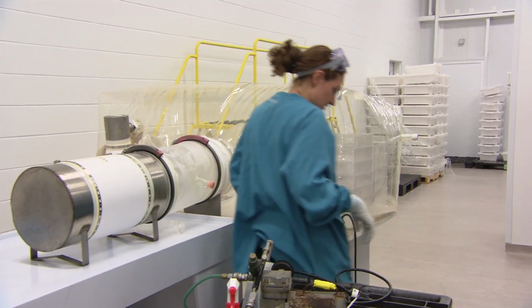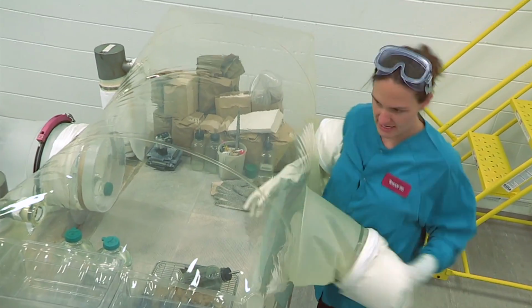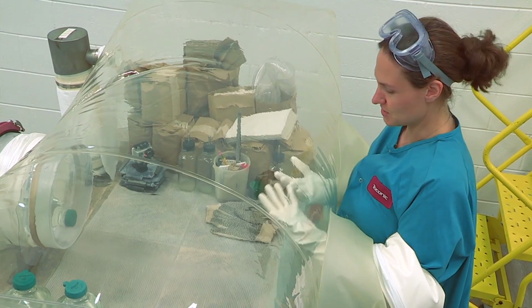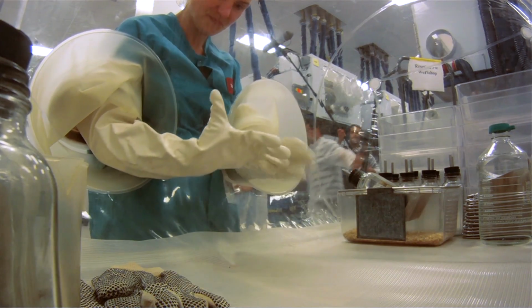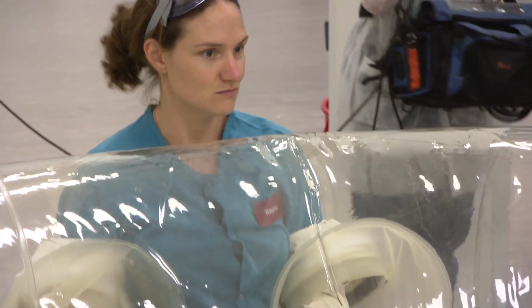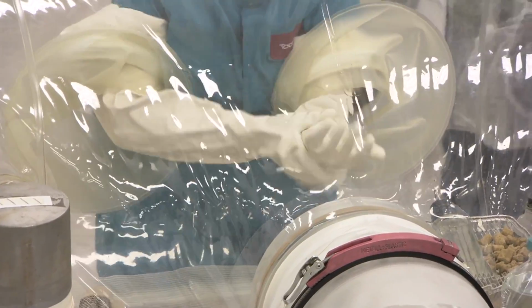So I'm just gonna hop into the isolator, and now, every time I enter an isolator, it's always good practice to check your gloves, because you never know. So it's always good to look at all of the fingers, up and down, in between, and you never know. Even though you are wearing your canvas gloves, you never know if, when you're handling a mouse, for some reason a tooth might have gone through. So it's always a good practice to, before you even get started, look at your gloves, look up your sleeves.